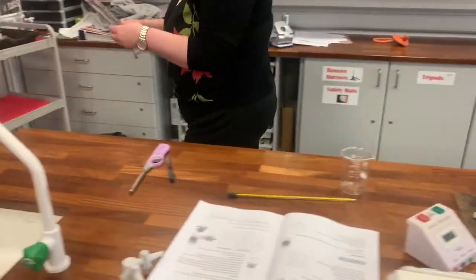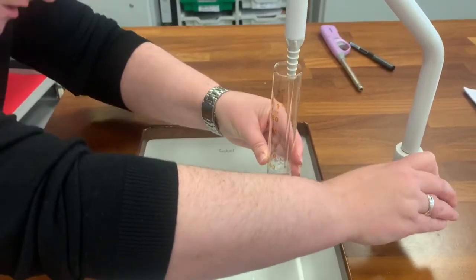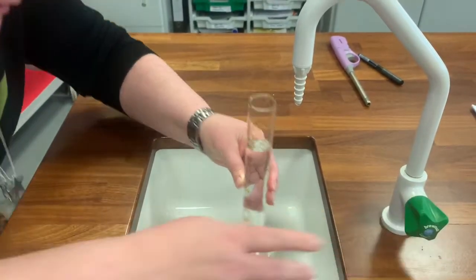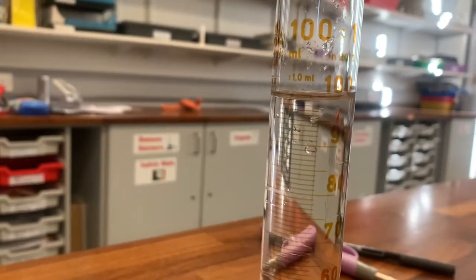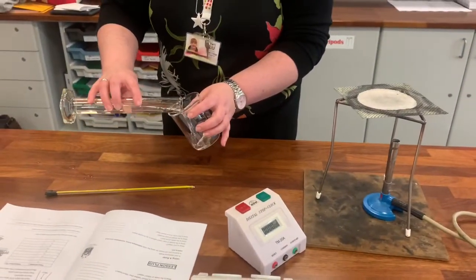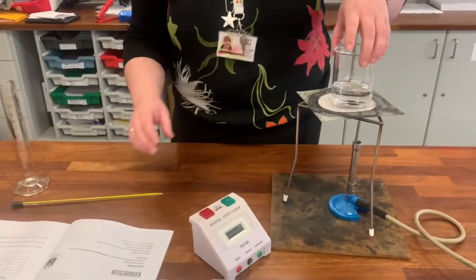Looking at the method, we're going to use the measuring cylinder to measure 100 centimeters cubed of water. If you were in the lab you would just use the sink. You really need to get down to eye level to check — put it on a flat surface and get down to check it's the right volume. You can see it's 100 — the bottom of the meniscus is on 100. Then pour that water into the beaker, making sure all of it goes in and none spills out, then put the beaker up on top of the gauze.